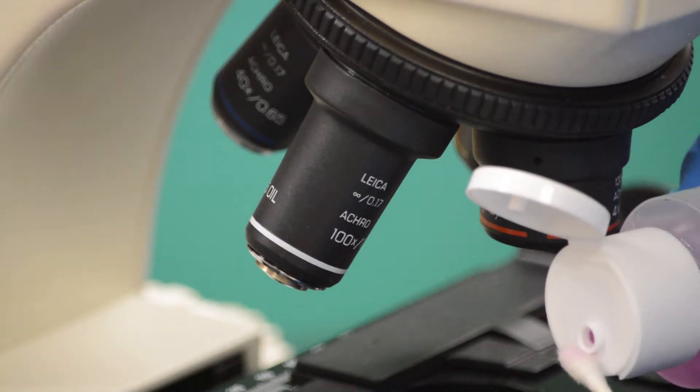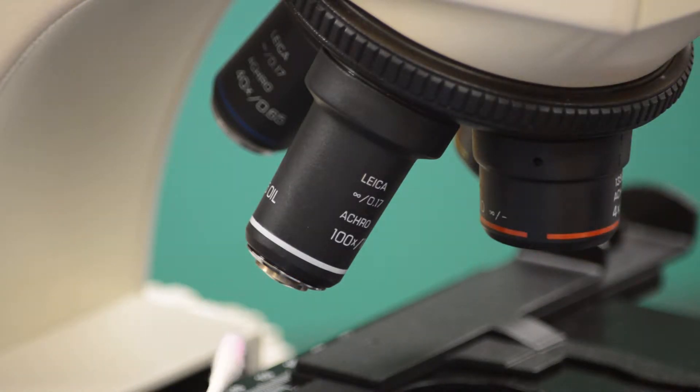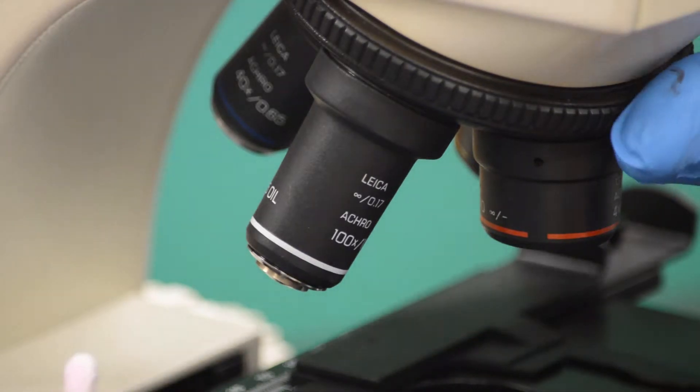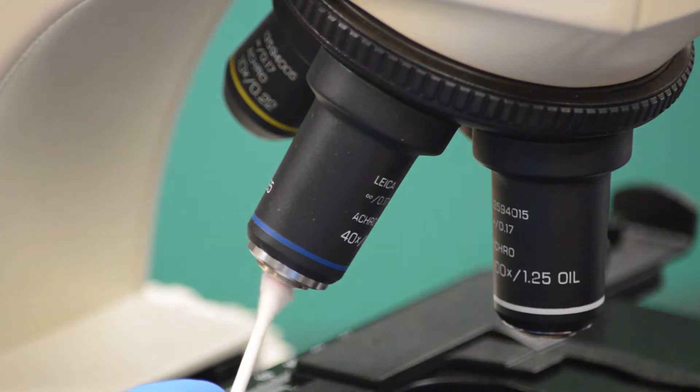A sterile cotton swab can be used in a similar manner to clean hard-to-reach places such as the lens of the 40x objective. Take the cotton swab and spray it once with the lens cleaner solution. Then, holding the swab about an inch back, wipe the surface of the lens, rotating the swab.